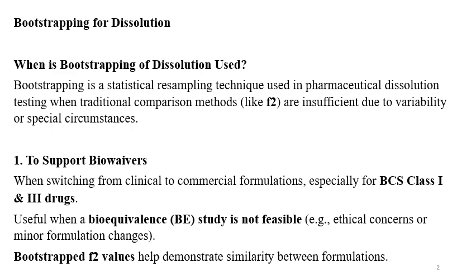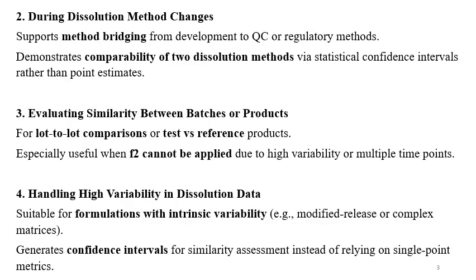Bootstrap method provides you some F2 values, and these F2 values help to demonstrate similarity between the formulations. So this technique is also F2 based technique, but it uses the statistical technique of resampling the results. So if the F2 is above 50 by bootstrapping, then you can say that the dissolution profile is similar.